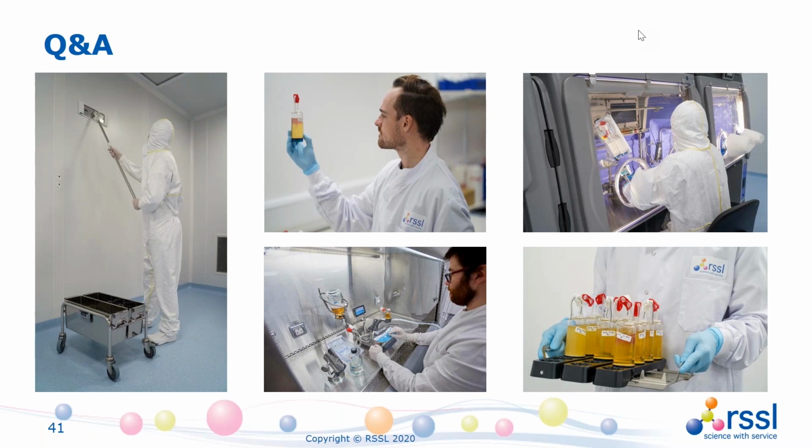For cleaning validation, yes, there is. So if we're trying to clean a vessel or something, for the actual clean room, it still remains that it is an assessment of visual cleanliness, but it's also partly understanding the products as well. There's less concern with residues with neutral detergents. And there are some disinfectants on the market that come as low residue to almost zero residue disinfectants. So we have greater confidence with those.